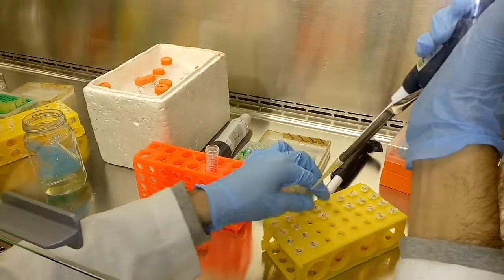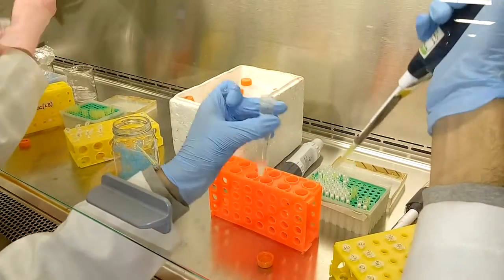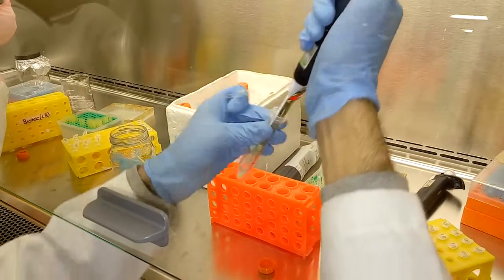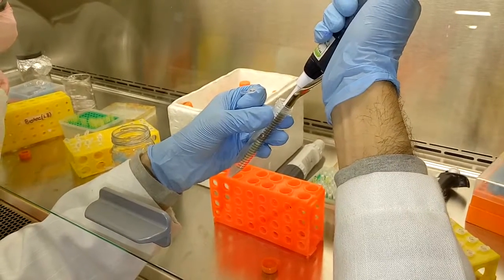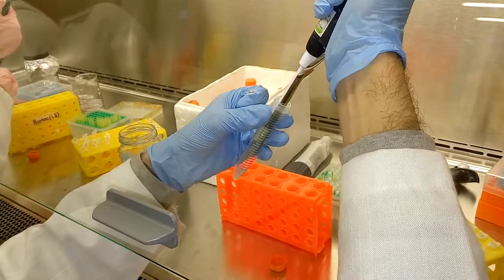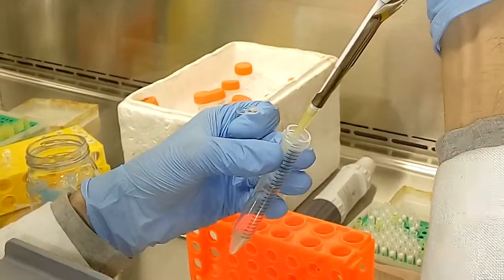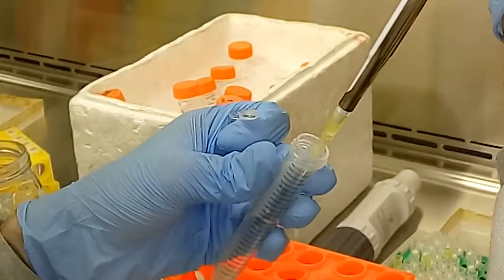The cells used for ligation are the TOP10 cells, which have some important characteristics of this process. Its genotype is the following. Some of the most important elements in its genotype are lacZ delta M15, an element required for the beta-galactosidase complementation when plated on X-gal.